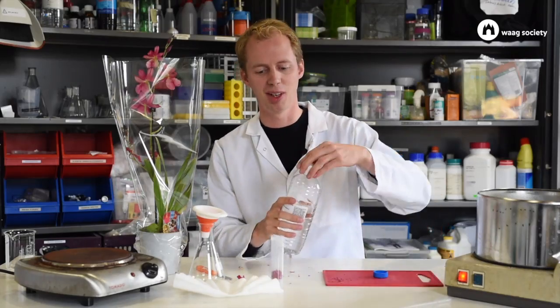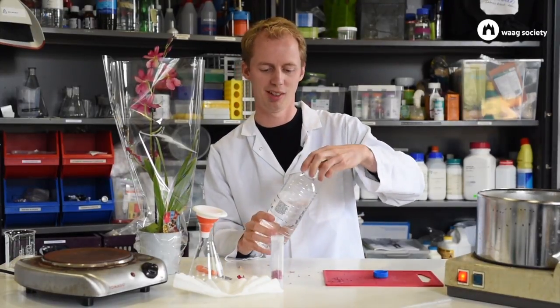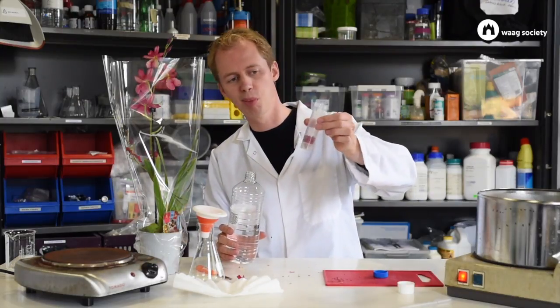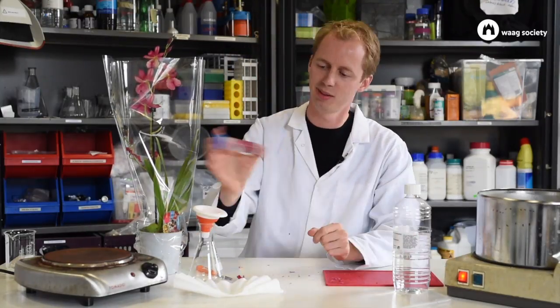The next step is to do extraction. I've got some 96% alcohol here — it's an organic solvent, it will do the job. If you use two leaves, I would say pour in about 20 to 25 milliliters. Close the tube and shake a couple of times.